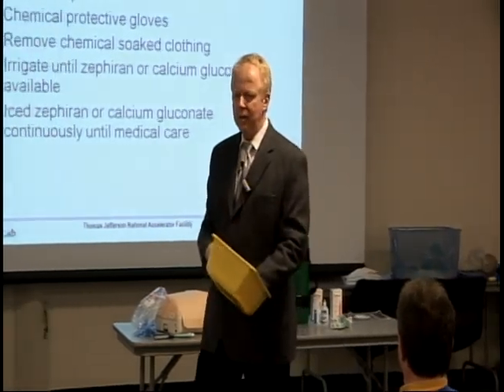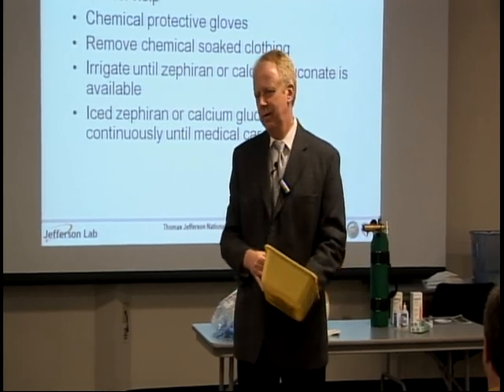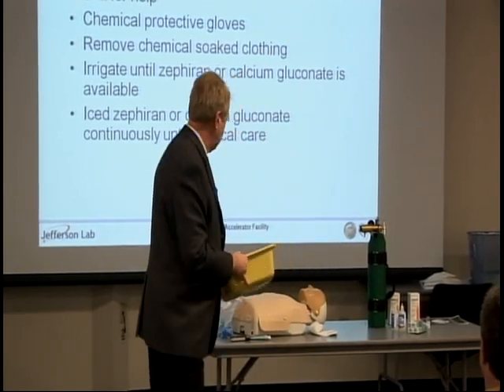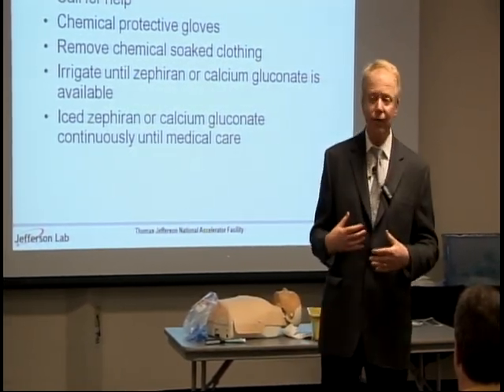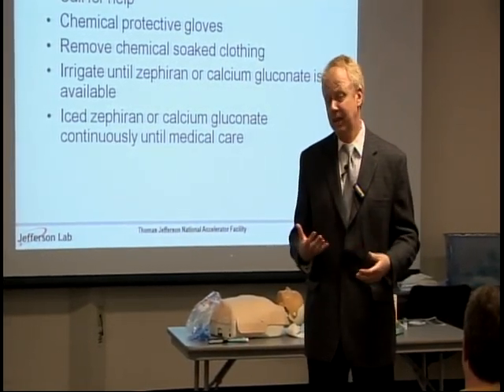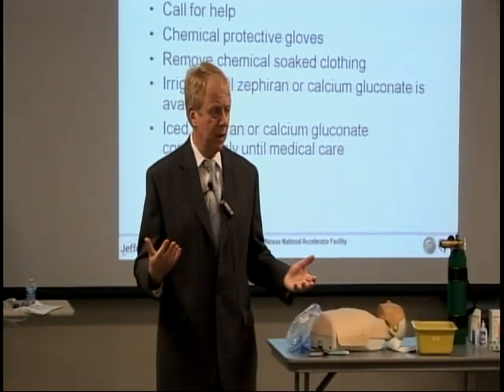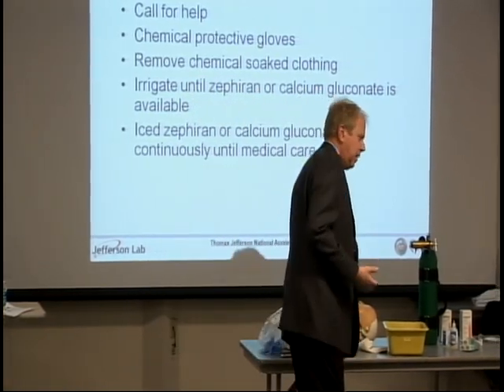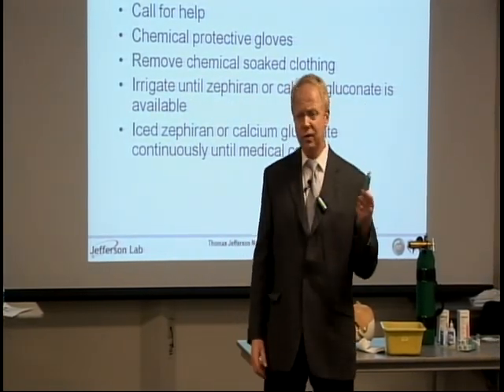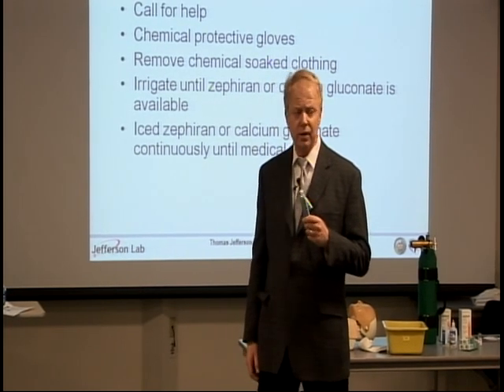Chemically, Zephyrin binds fluoride slightly better than calcium gluconate does. Now if you have a chest exposure, act fast because your colleague is probably going to die. Rip off the clothing — you've got the exposed surface. It's hard if you have half your chest exposed to use the cream, so once again the Zephyrin option should be seriously considered.